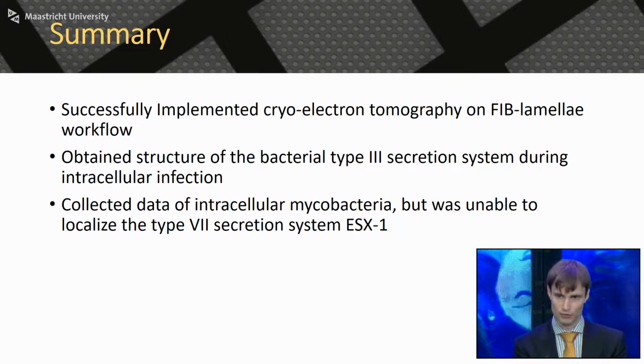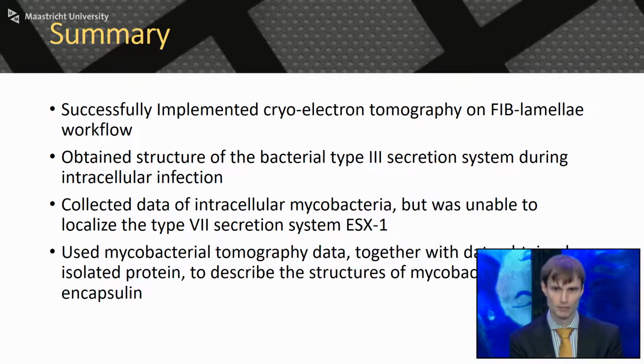However, we were not able to actually find the complexes. But we were able to use this data, together with data obtained on isolated protein, to obtain structures of the mycobacterial encapsulin in different structural states, which gives insight into how these complexes may assemble from their basic components.